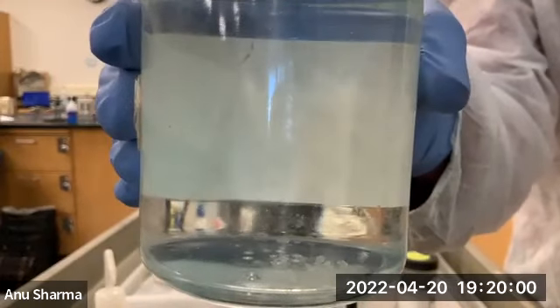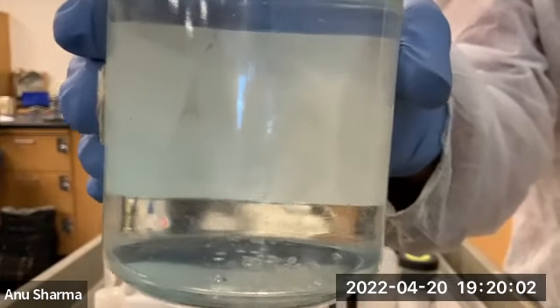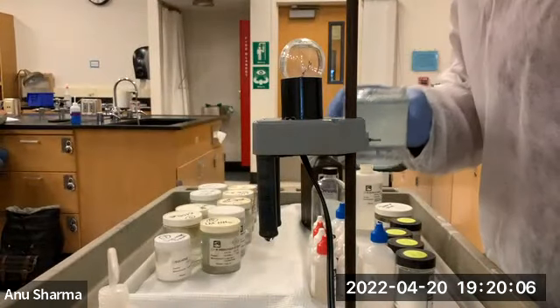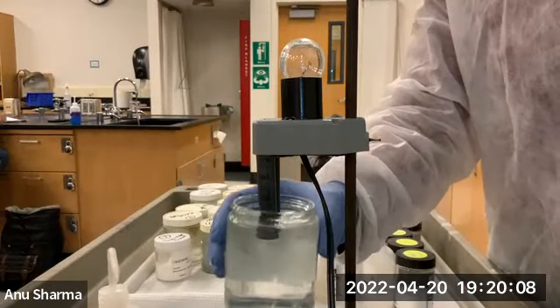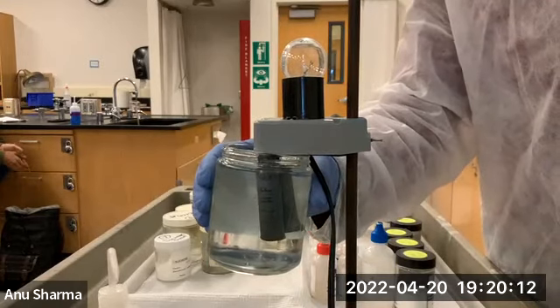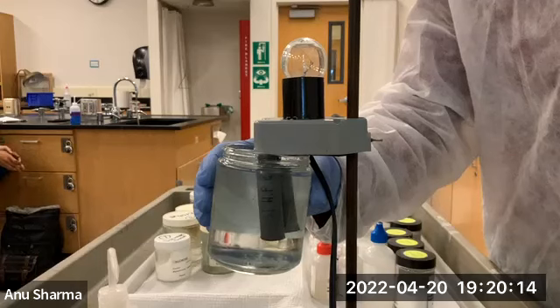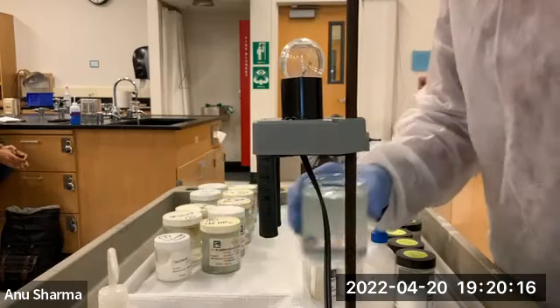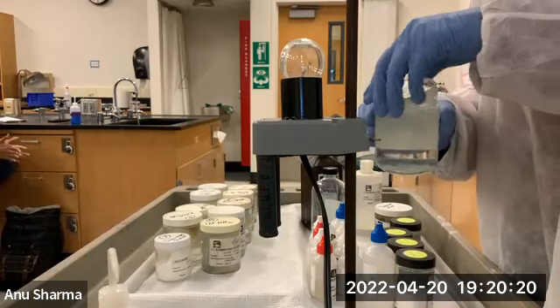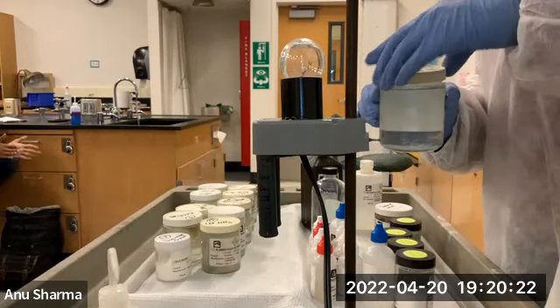That's why it forms a nice clear solution, because the OH groups get hydrogen bonded with water. That's how it dissolves. But the OH groups are not available for bonding. So non-electrolyte, and the major species is still C12H22O11. Okay, so that was number 8.